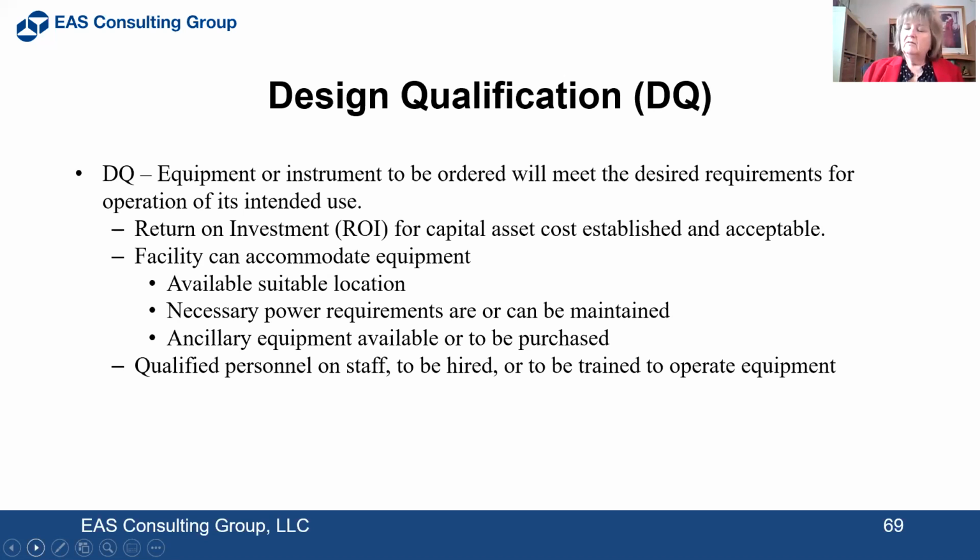We had to rewire an entire lab once just to be able to put an ICP-MS in there because the power was so much greater than for other pieces of equipment that we had. You also have to prepare for qualified personnel to be on staff, to be hired or be trained to operate equipment. And again, with that ICP-MS, we had to send somebody to training to be able to run that.